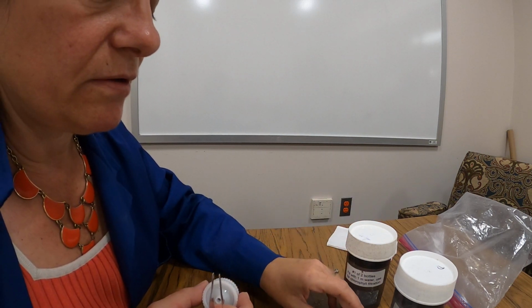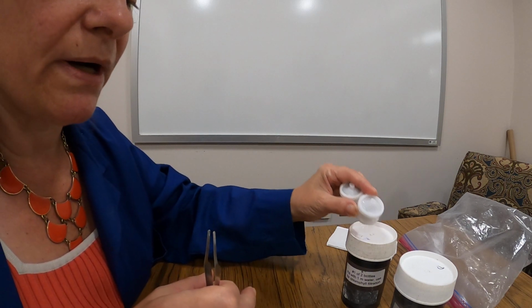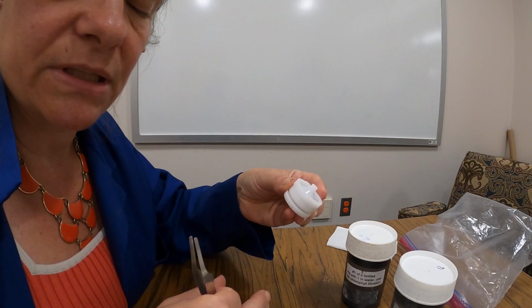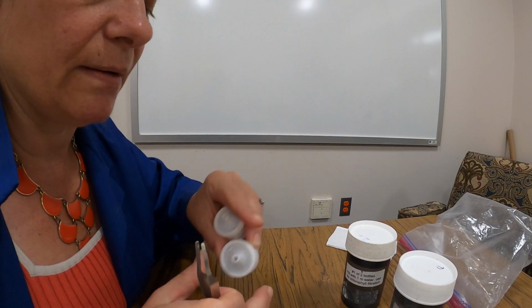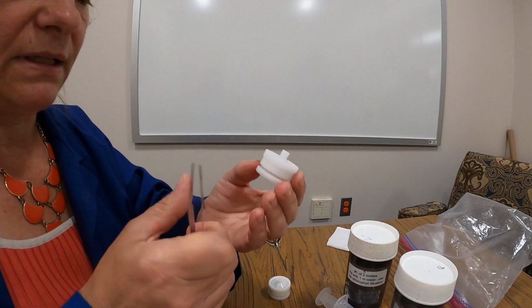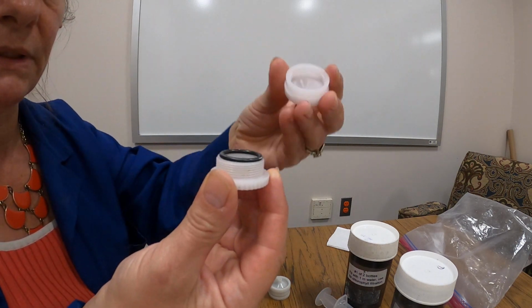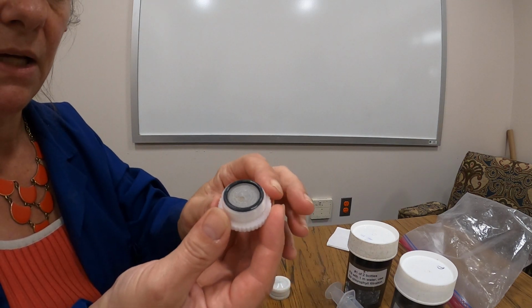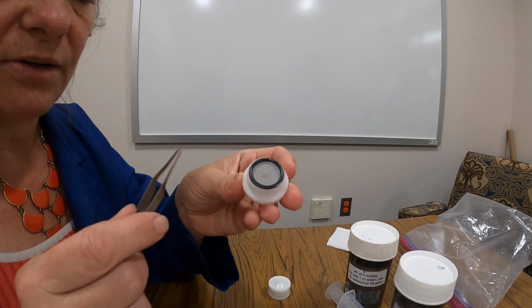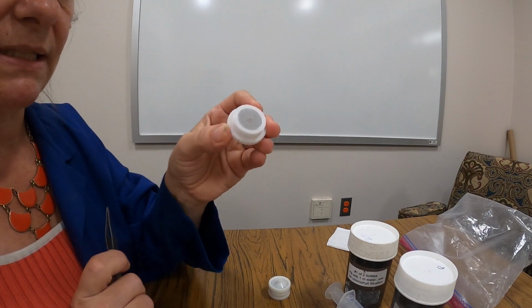So what I like to do is, because I want to take 2 filters from each bottle, I go ahead and get both filter holders set up so that I'm ready to filter my first sample. These filter holders just unscrew, you lift the top off. Usually the O-ring will be there. Sometimes it gets stuck to the top. No big deal if it does.